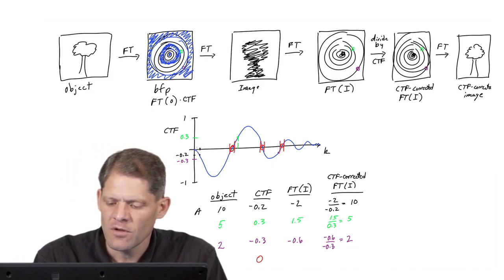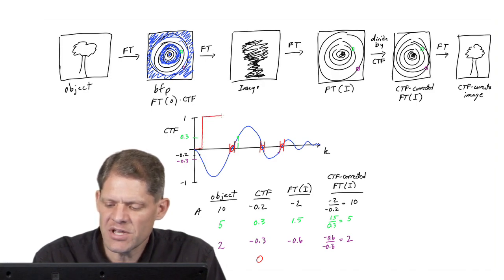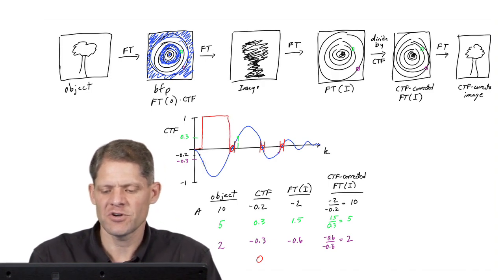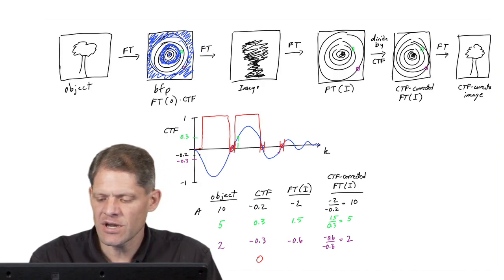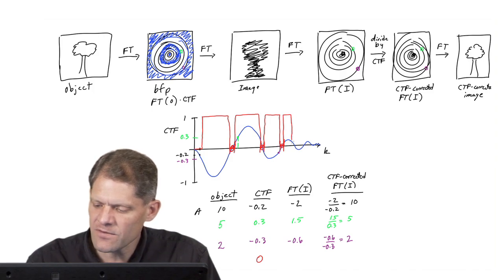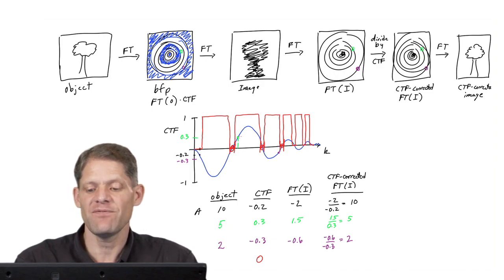And if you do this, what you'll do is CTF correct those regions that you can and restore the effective contrast transfer function back up to the value of 1. And then you'll be missing the values here around CTF zeros. And you'll get a final CTF that looks like this, etc. Now there's recovering those regions of the CTF where it's significantly non-zero.